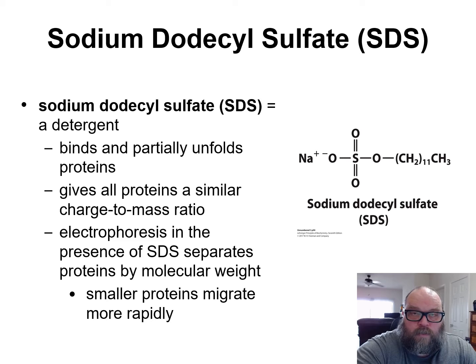One of the things you will notice, though, is when you read the literature, you'll hear this referred to not as just electrophoresis, because there are so many different types of electrophoresis. But you're going to see it referred to as SDS polyacrylamide gel electrophoresis. Polyacrylamide is a type of gel electrophoresis. You're putting your sample into an electrical field and you're trying to see how things move, distances and all of that.